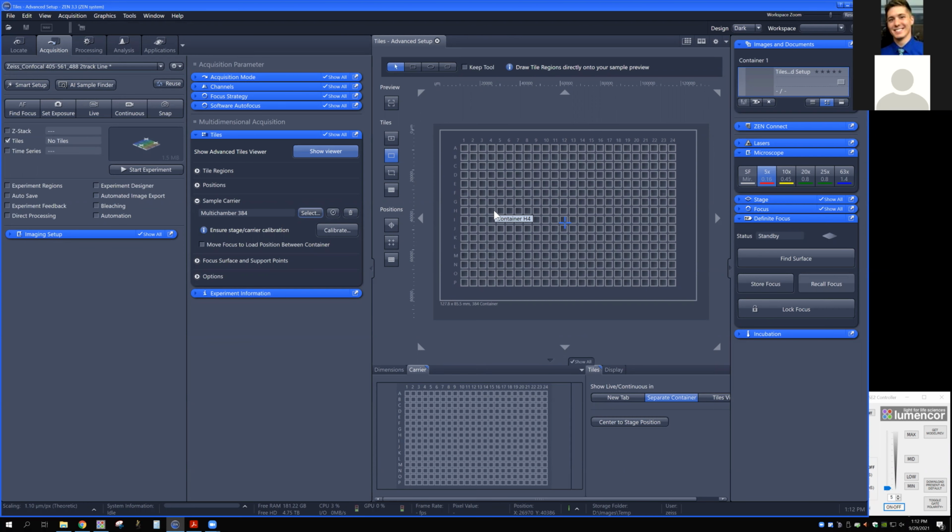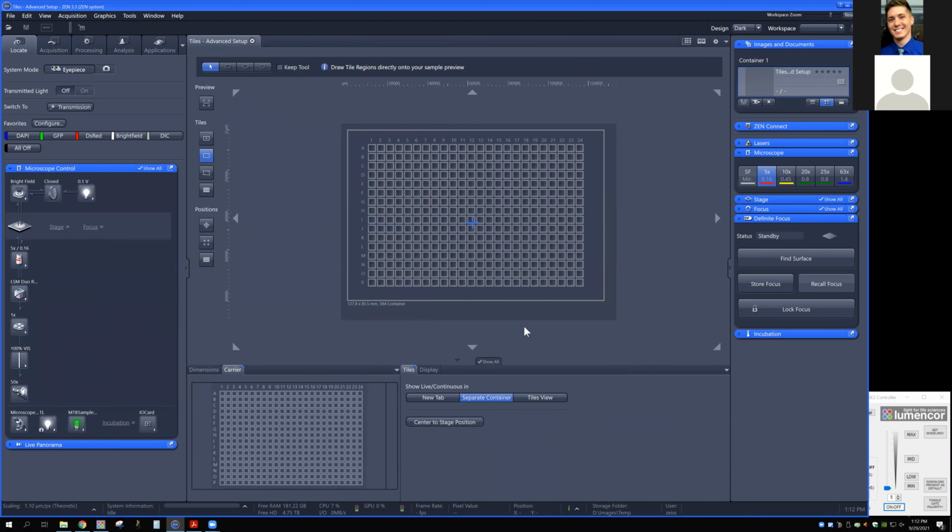You want me to do it? What's the easiest way to get started? Do you want bright field or do you want fluorescence? That's a good question. Let's just move to one of the, so it's going to be M and N.